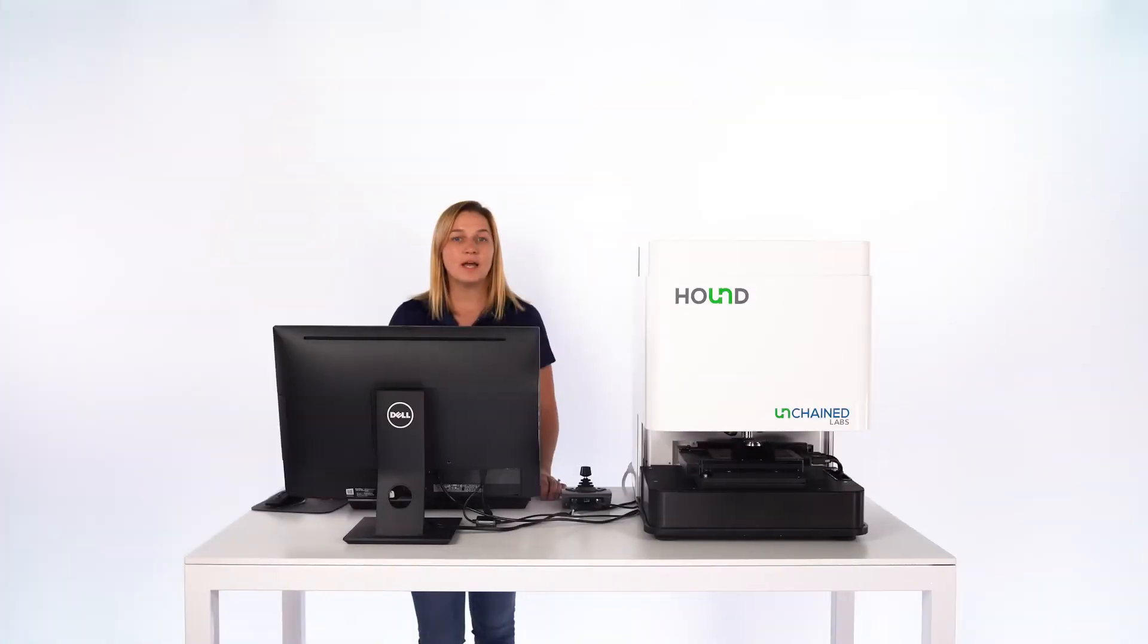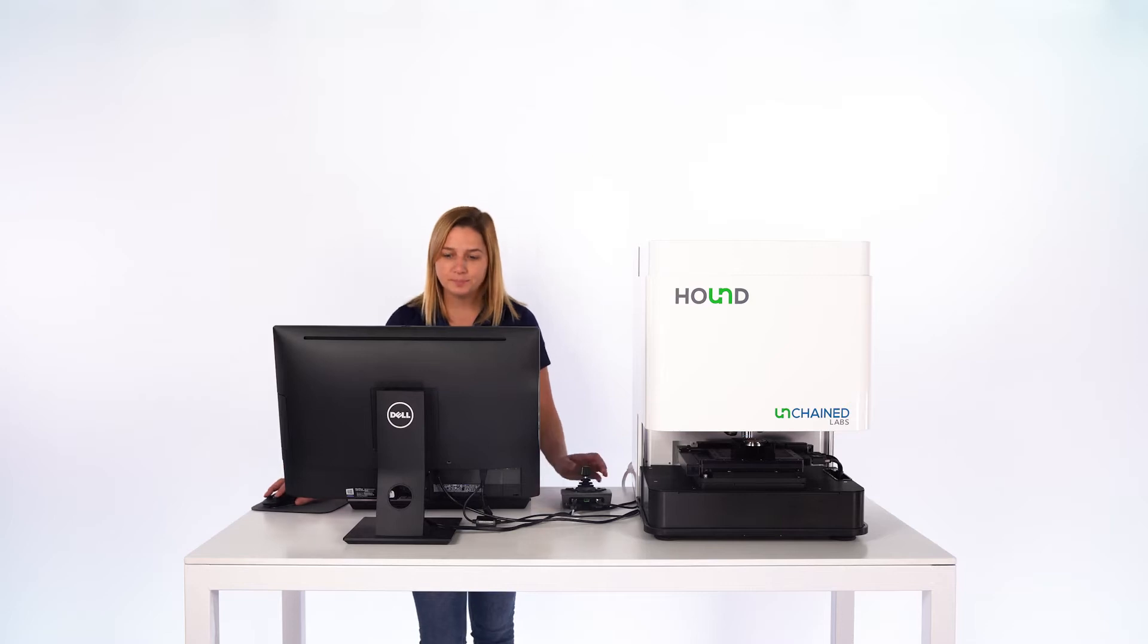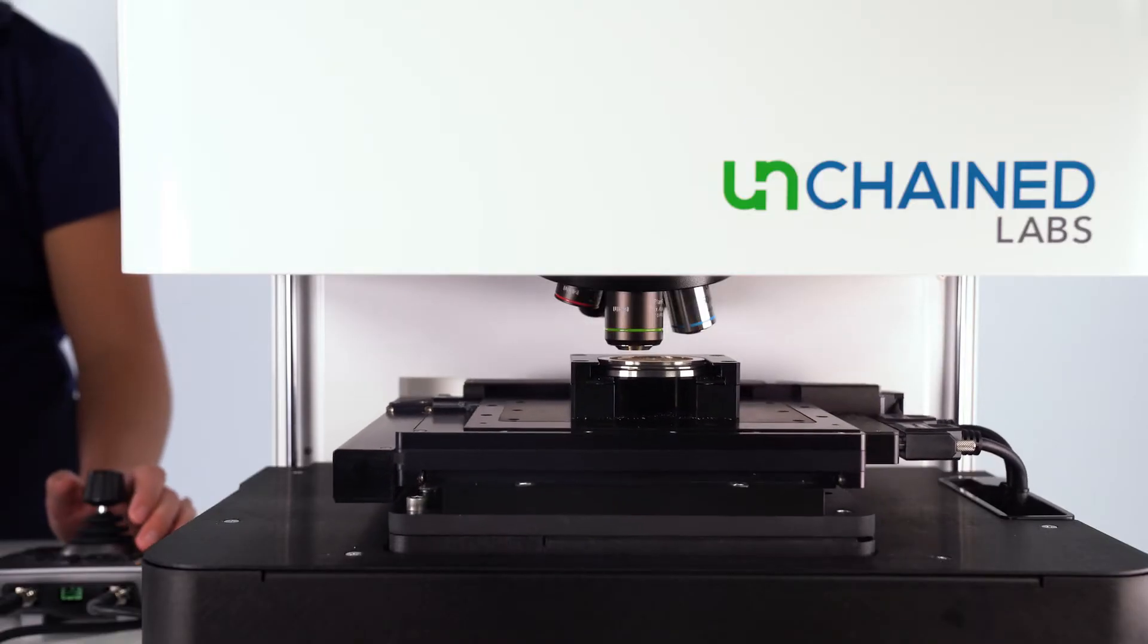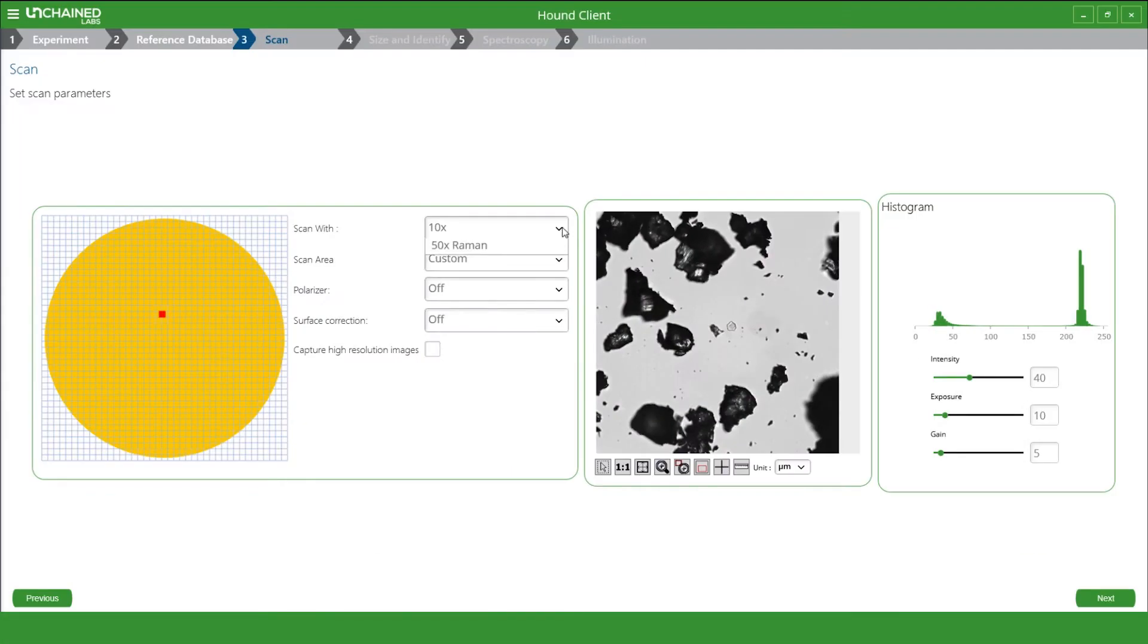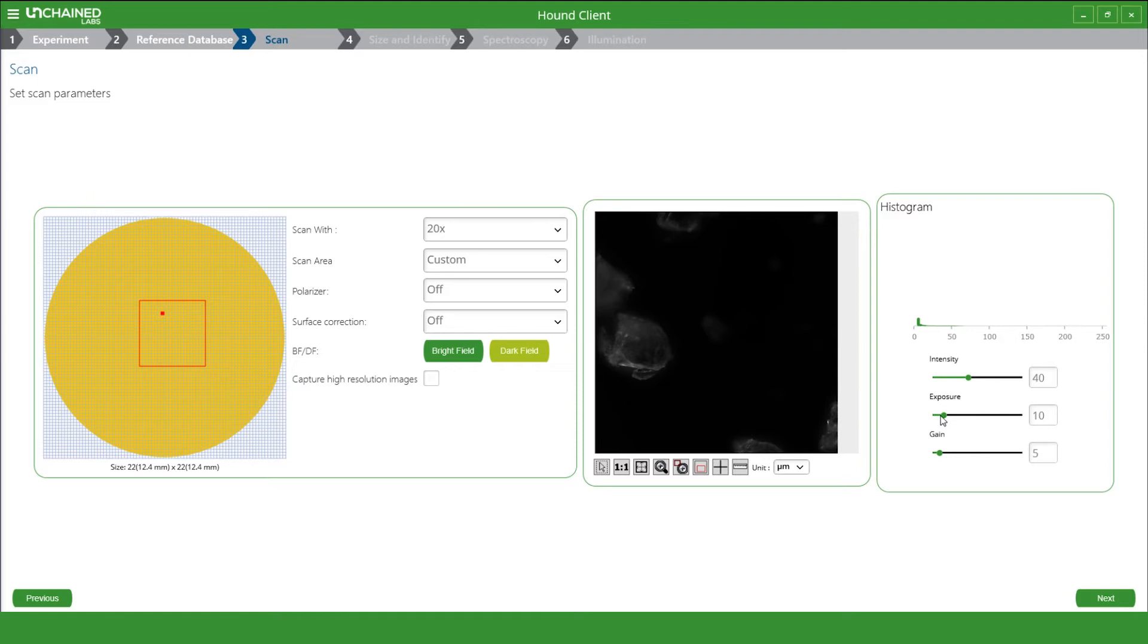Now we can see our particles and choose the area we want to scan. The reflective surface of the gold-coated glass provides high contrast for our dark field imaging, so that way we don't miss a single particle, especially when they're basically transparent.